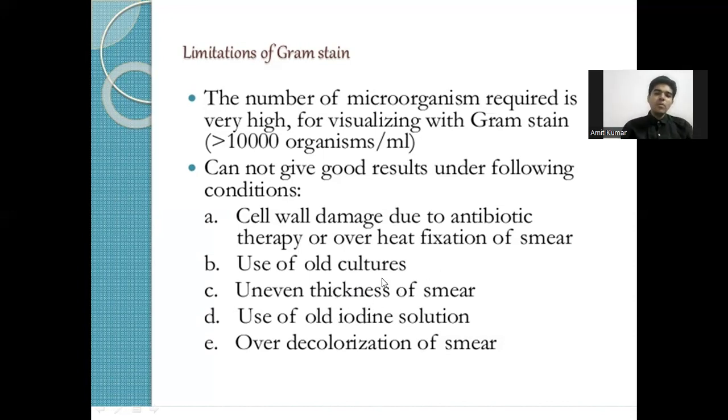Then the thickness of the smear also matters in gram stain. If the smear is too thin, it is easily decolorized by the action of acetone, and in that case gram positive bacteria look like gram negative bacteria. If the thickness is too high, then it requires much more time to decolorize.